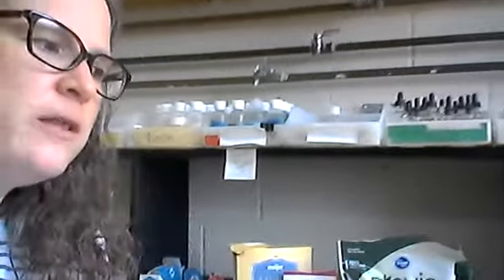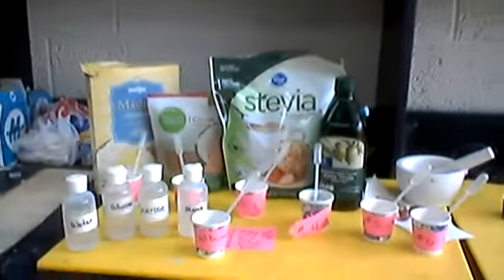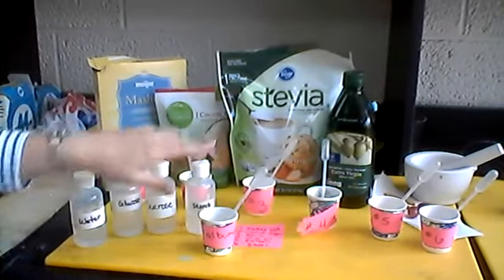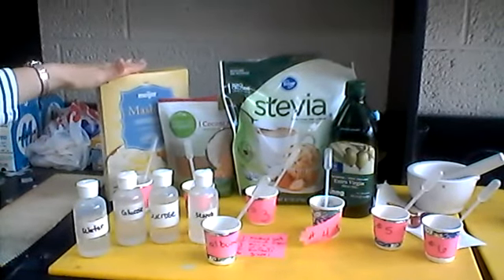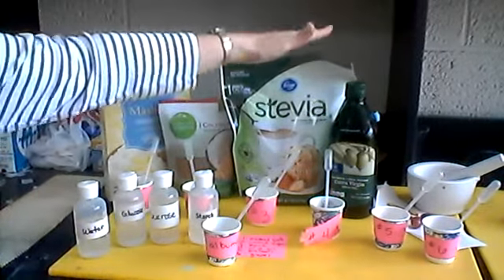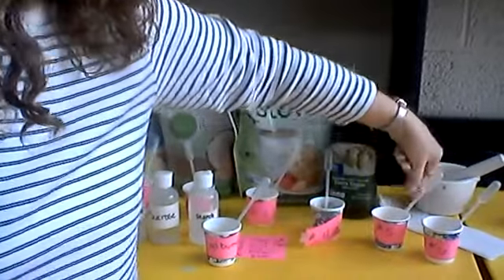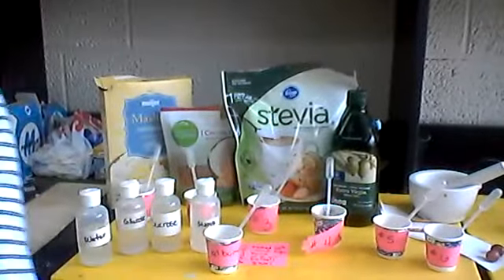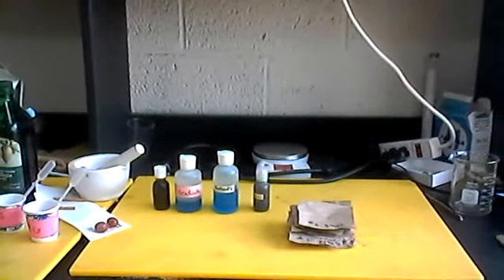So we're going to look at biomolecules in different foods and substances here. So we've got all these different things here. We've got water, glucose, sucrose, starch, albumin, which is like egg yolk or egg white. We've got some instant mashed potatoes dissolved in water, coconut sugar, stevia, olive oil, and then I just used a mortar and pestle to crush up just some pretzels and some grapes. So we're going to look at the different properties of all these different foods by using a number of techniques.